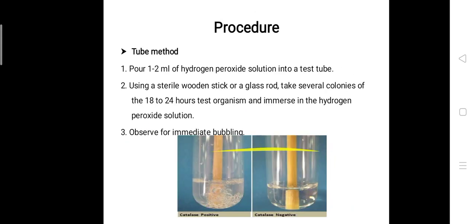Next we'll discuss the tube method. For the tube method, you're going to need a test tube, which is obvious—the name itself suggests tube method. You have to pour one to two ml of hydrogen peroxide solution into a test tube.